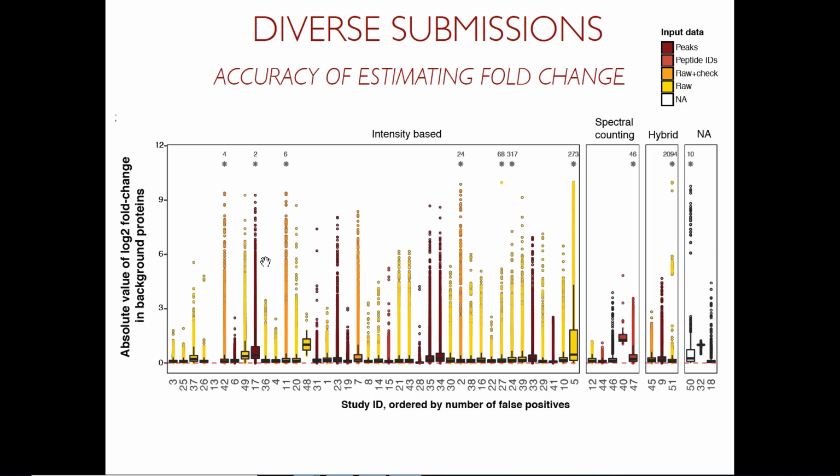They said, okay, these are not true systematic signals. These are just artifacts of random variation. But this group of submissions were misled by these changes, and they claimed that these are true changes in abundance. And so the goal of what we need to discuss in these 2.5 days and also in the next week is how do we go about distinguishing true changes from these artifacts.